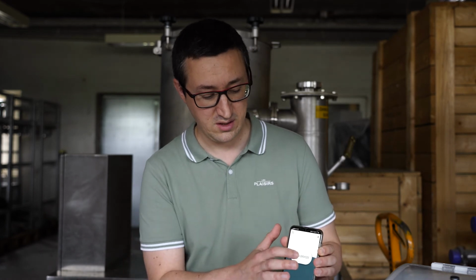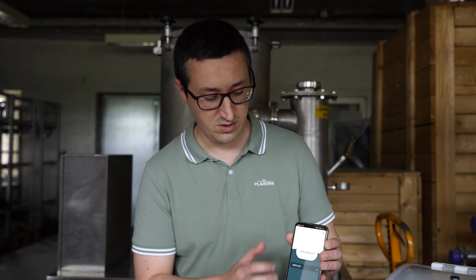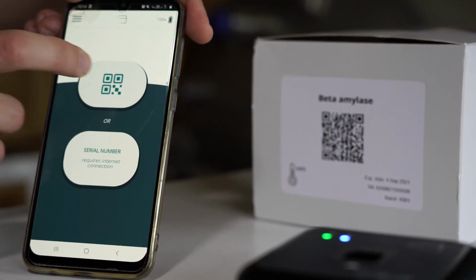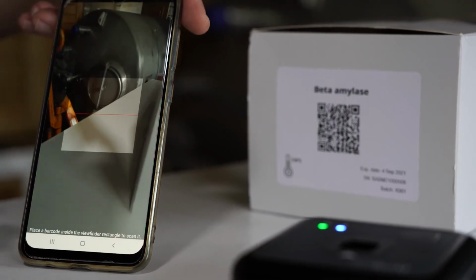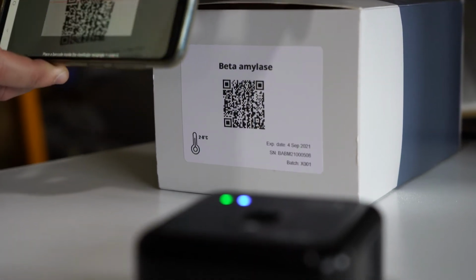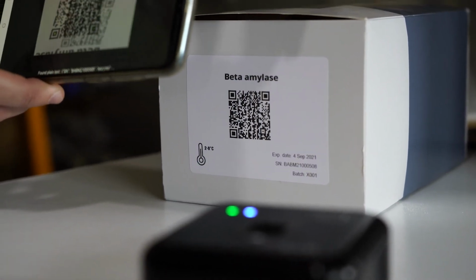In order to measure with our Series spectrophotometer, what you need is to open the app, BrewerStream. As I mentioned, you can download it from the App Store or Google Play Store. And the first page that appears is to scan the devices. This device needs to be turned on to be able to read it. In this page of the app, you scan the QR code by pressing this button, and then scanning the QR code.